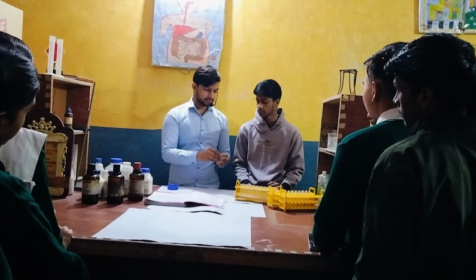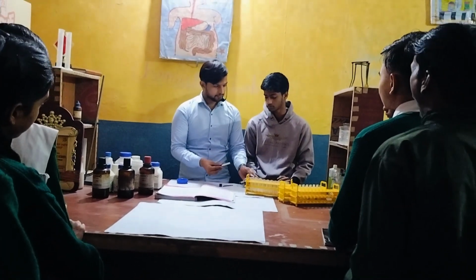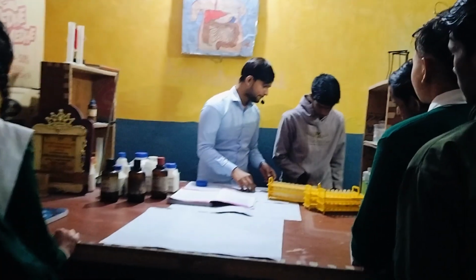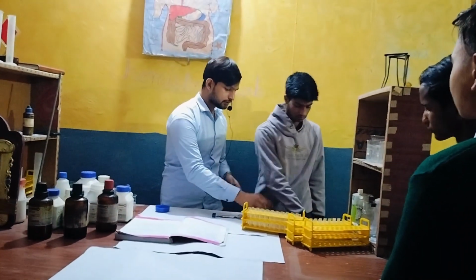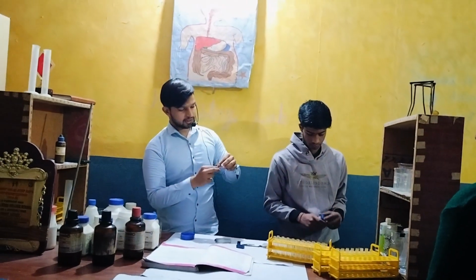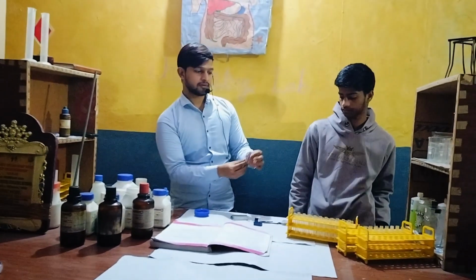Next, we have blue litmus paper. This is blue in color, as you can see.